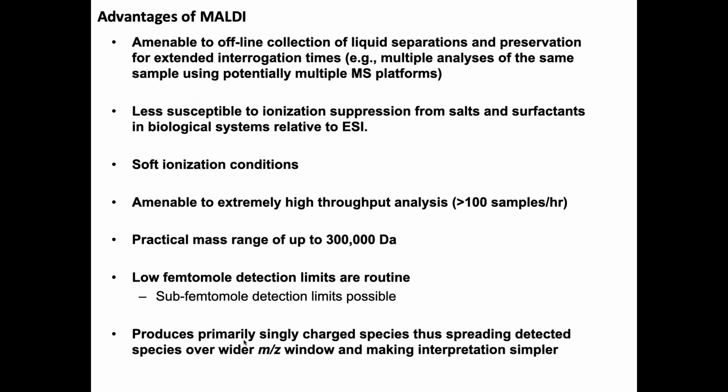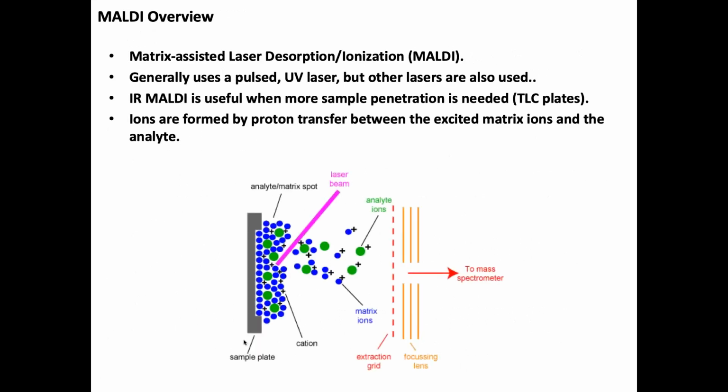When you start whacking it in the middle with neutral molecules, you can analyze the different B and Y ions. Singly charged, you don't have as much internal energy in the molecule. It's just not as amenable to carrying charge when we fragment it, so it's not the best in that regard.